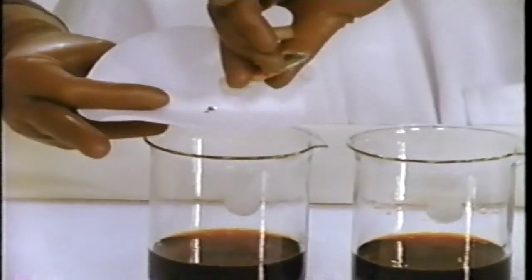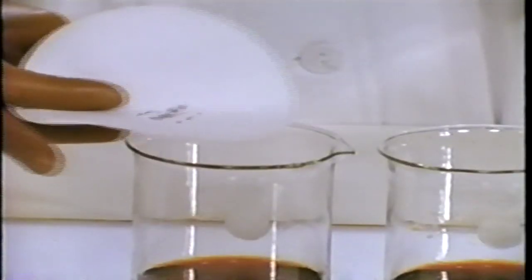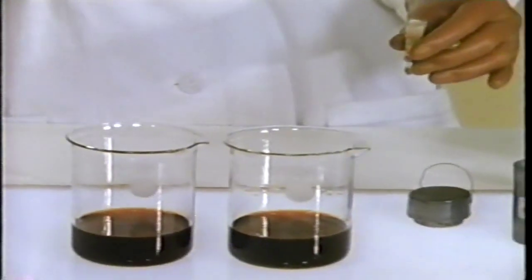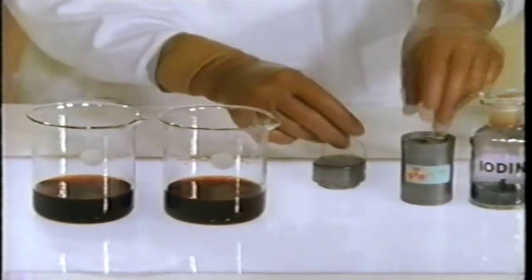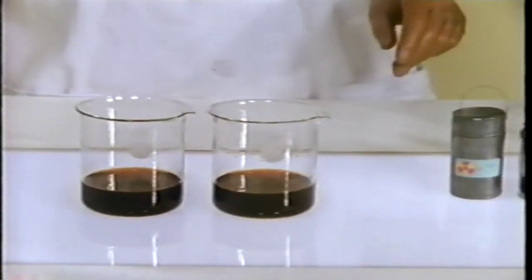Look at the radioactive iodine. It looks identical to ordinary iodine, the same lustrous gray plates. We add some to the saturated solution. Equilibrium is already established, of course, so the concentration doesn't change. But what about the radioactivity? Has any of the radioactive iodine gone into solution?